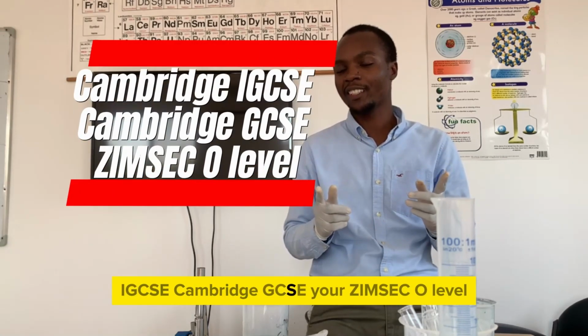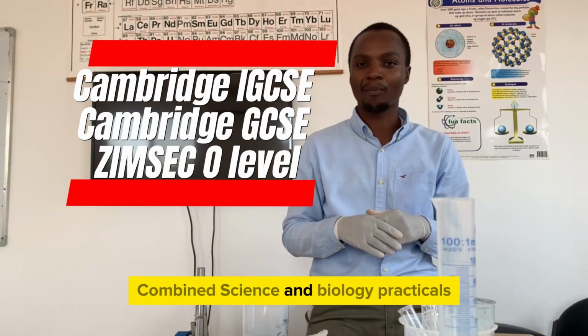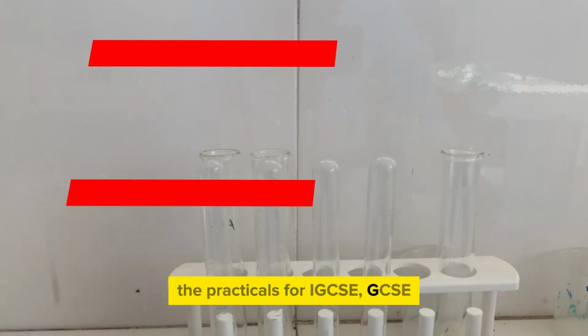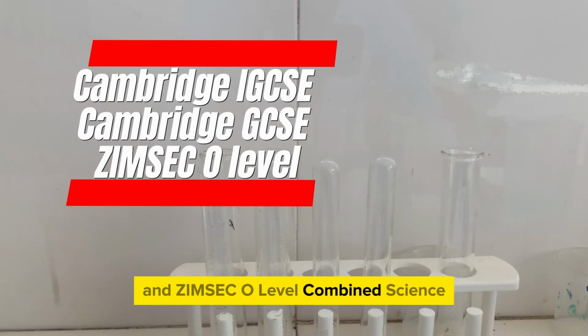Today I'll be demonstrating the food tests which are necessary for you to pass your Cambridge IGCSE, Cambridge GCSE, your ZIMSEC O level, combined science and biology practicals. So here I'm going to show you a demonstration of the practicals for IGCSE, GCSE, combined science and biology, and ZIMSEC O level biology and ZIMSEC O level combined science.